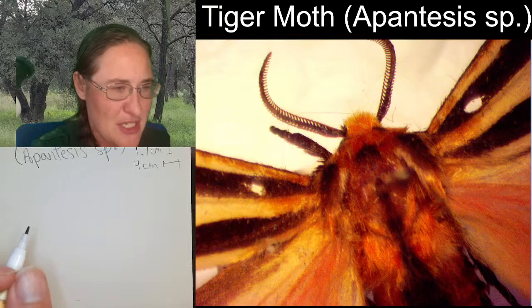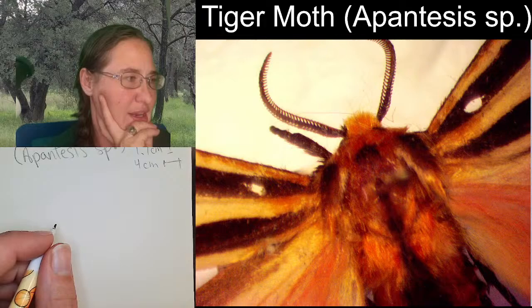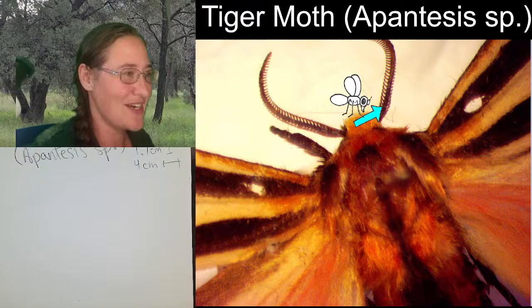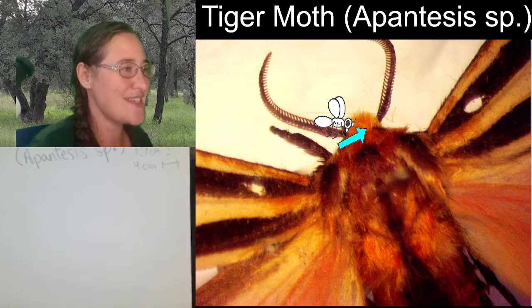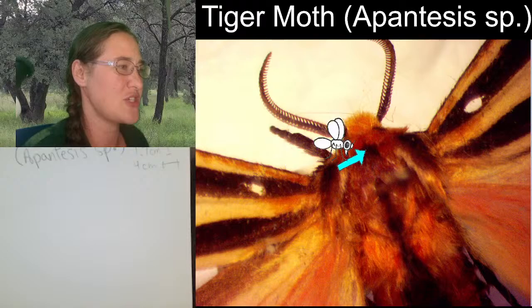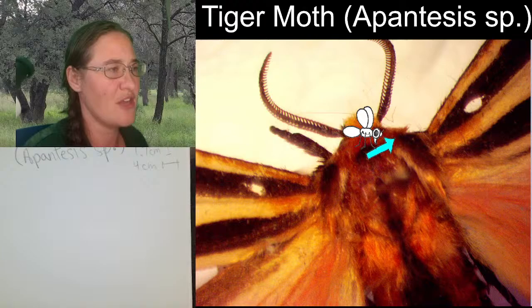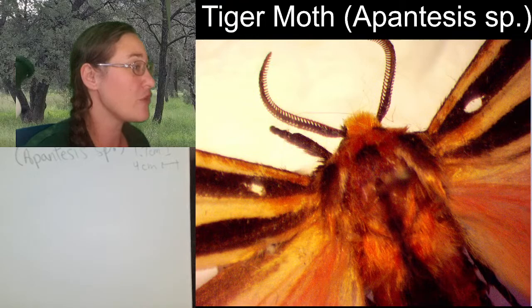All right, so I'm going to go ahead and get started. I think where I'm going to start is the head. And keep in mind, the head is itty bitty tiny on a specimen like this. It's right here. This little poof that almost just looks like a bit of hair is actually the entire head. Once you get anywhere past that, this whole section here is the thorax. And you have three segments. The first segment of the thorax is here, the second segment's here, and the third segment's here. This one that goes a little bit wider and is that triangular piece is where the first pair of legs are connected, and it is the first segment of the thorax.